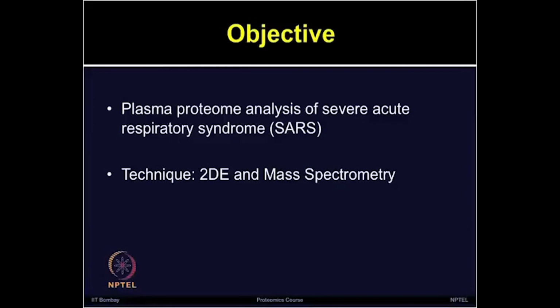In this study, the authors employed conventional two-dimensional electrophoresis, analyzed the images from the treatment and the controls, and identified the differentially expressed proteins using mass spectrometry techniques, including MALDI-TOF and LC-MS/MS. Finally, the interesting identified proteins were validated by techniques such as Western blots.